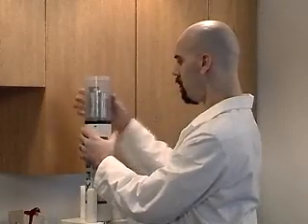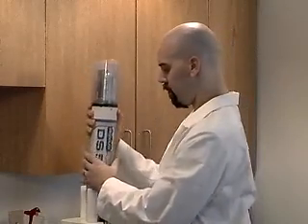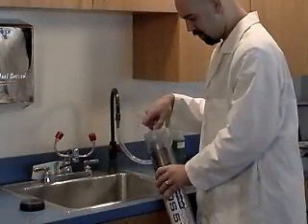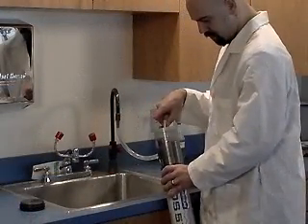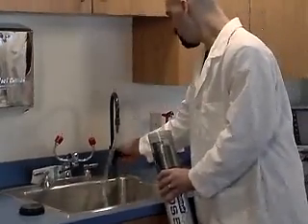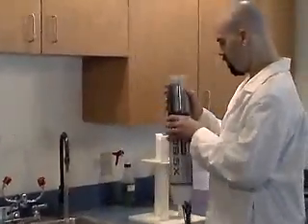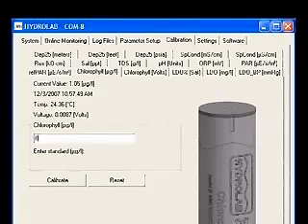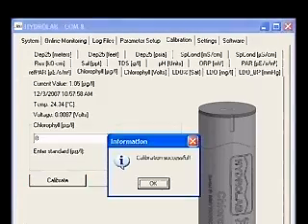Begin with a clean and dry Sonde. Attach the calibration cup and fill it to the threads with sample water that has been filtered of all phytoplankton using a 0.45 micrometer filter, or optionally deionized water. Wait one minute for readings to stabilize. Type 0 into the box and click Calibrate. A calibration successful message will appear.